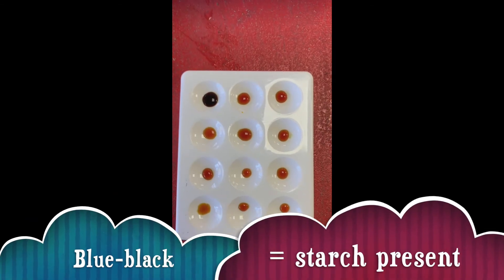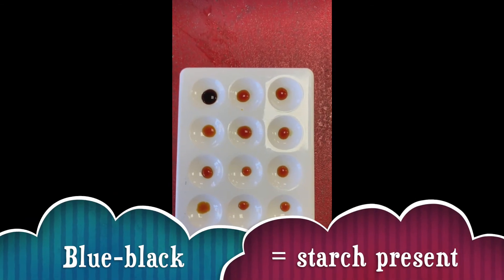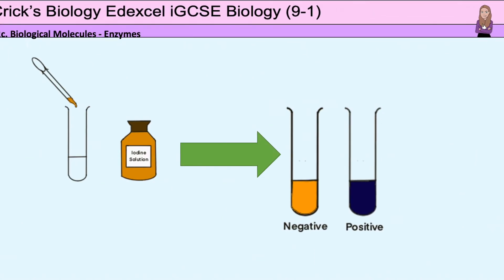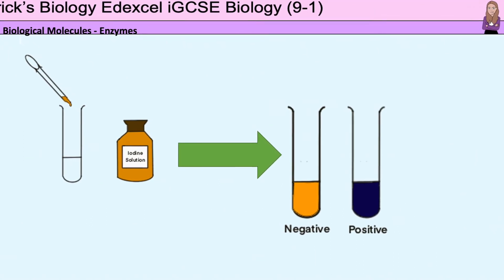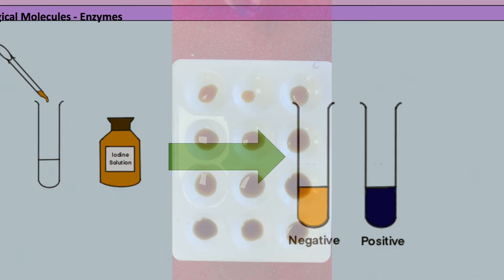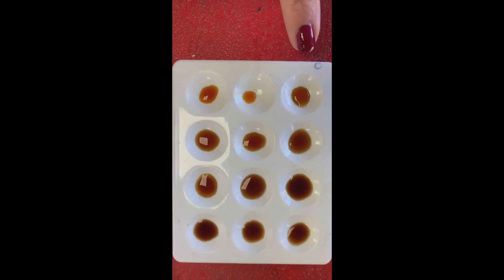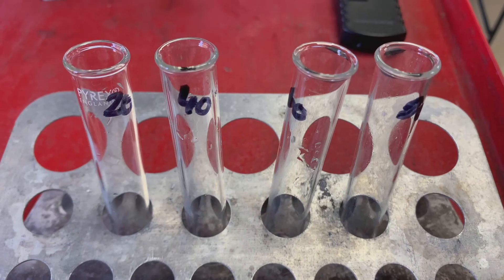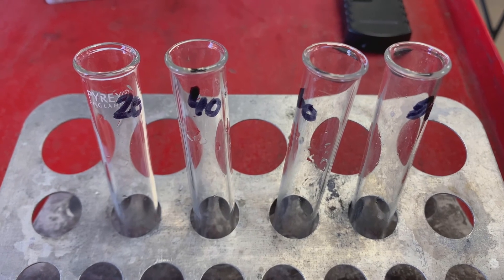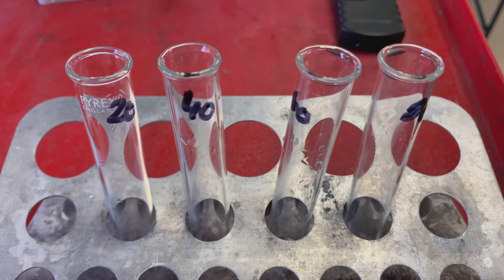As you can see by the colour, there is still starch present. Samples will be tested with iodine every minute until there is no further change in colour of the iodine solution. When iodine solution stays orange, there is no starch left — it has all been broken down by the amylase. At 0 degrees this took 10 minutes. Then repeat this process with the 20, 40, 60, and 80 degree solutions.